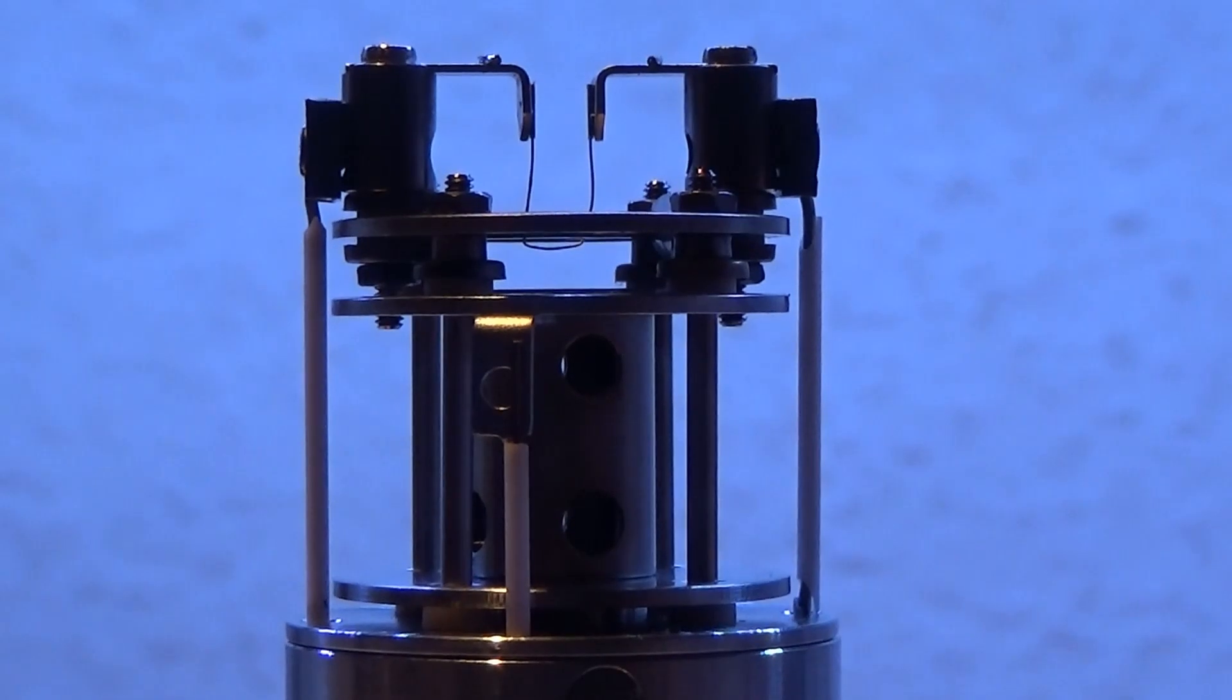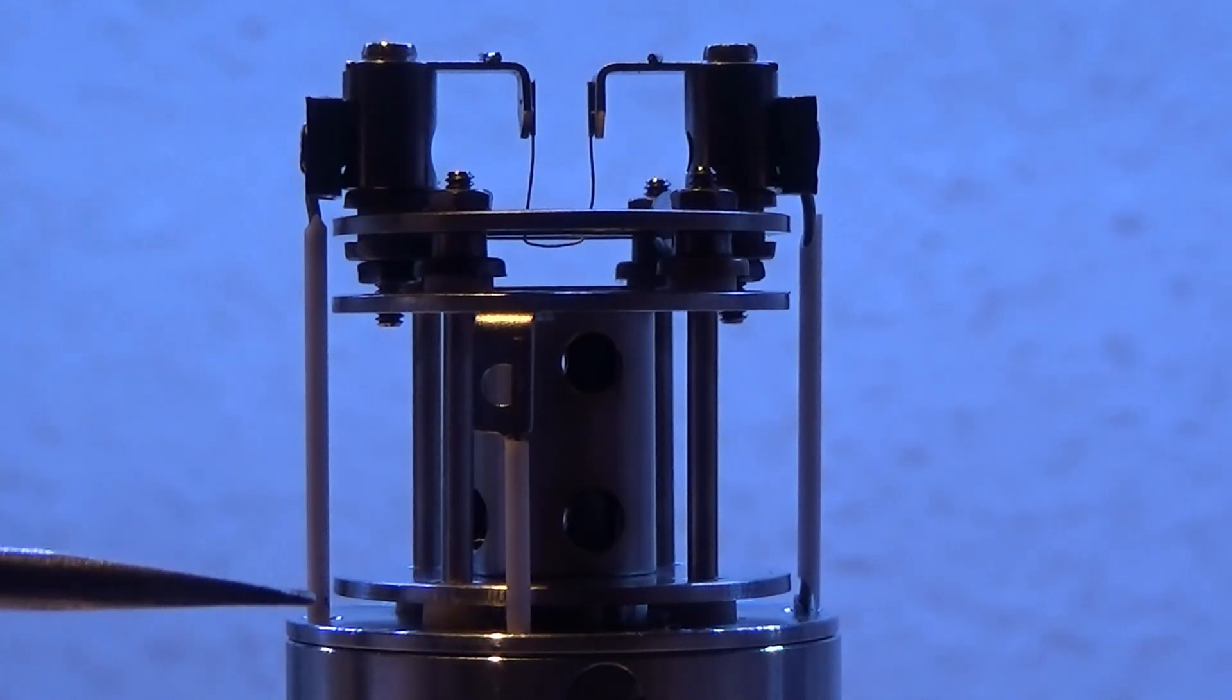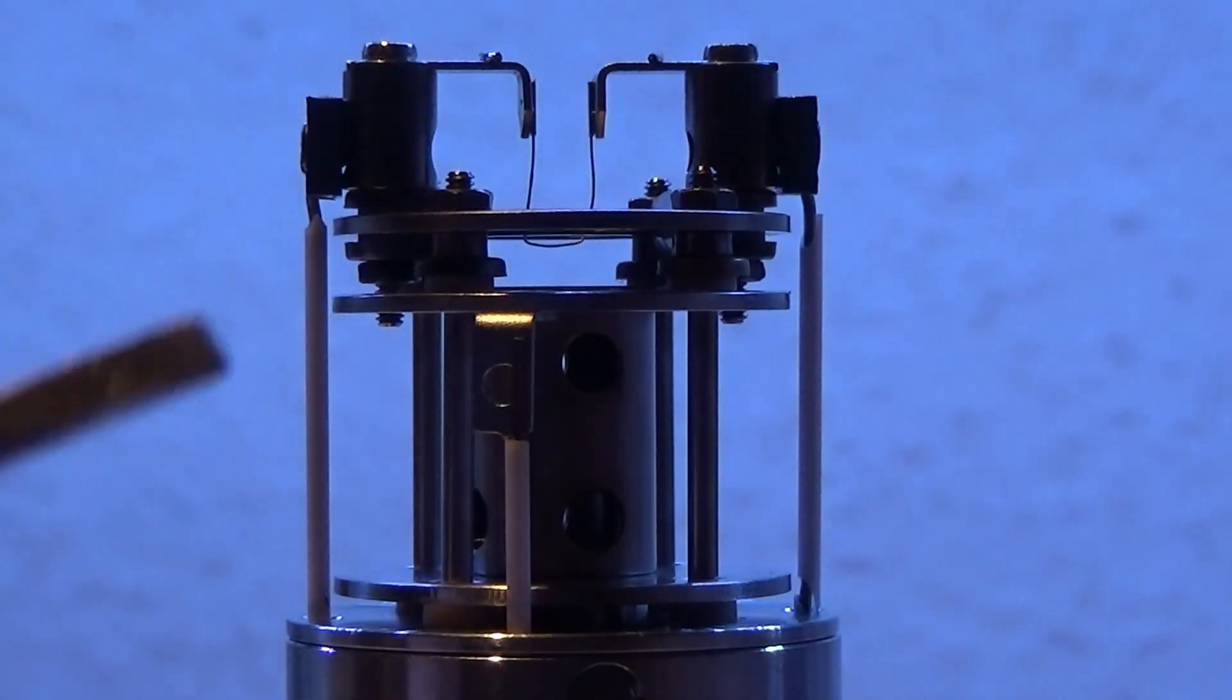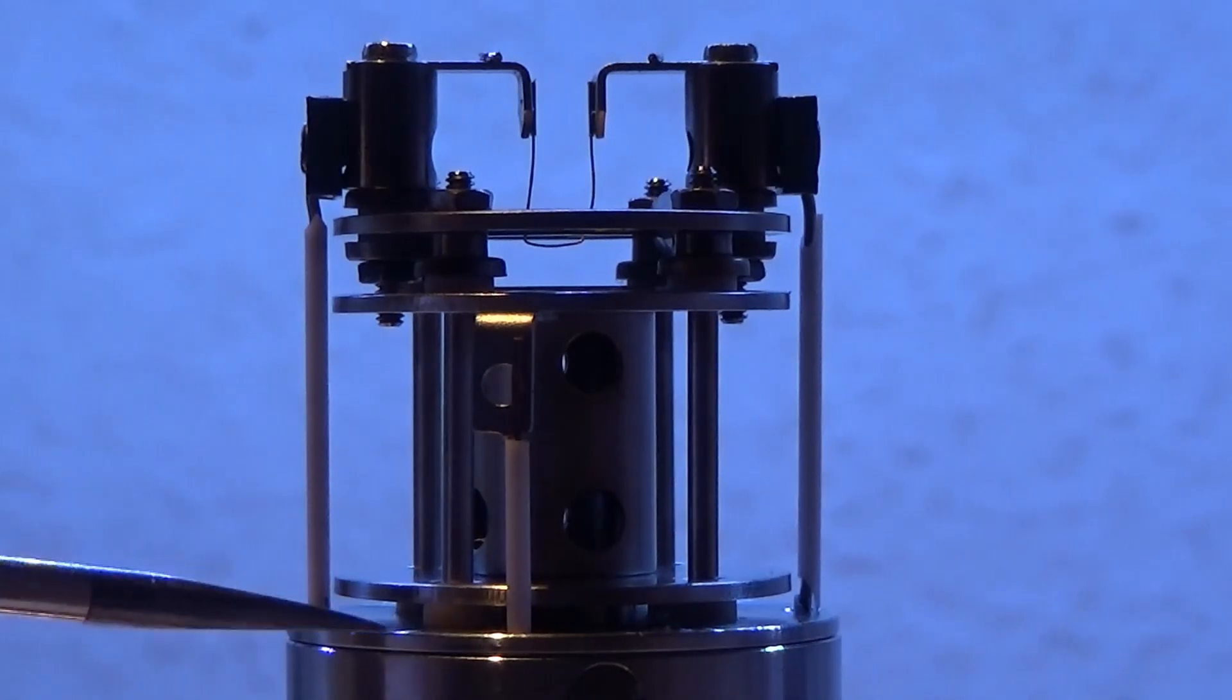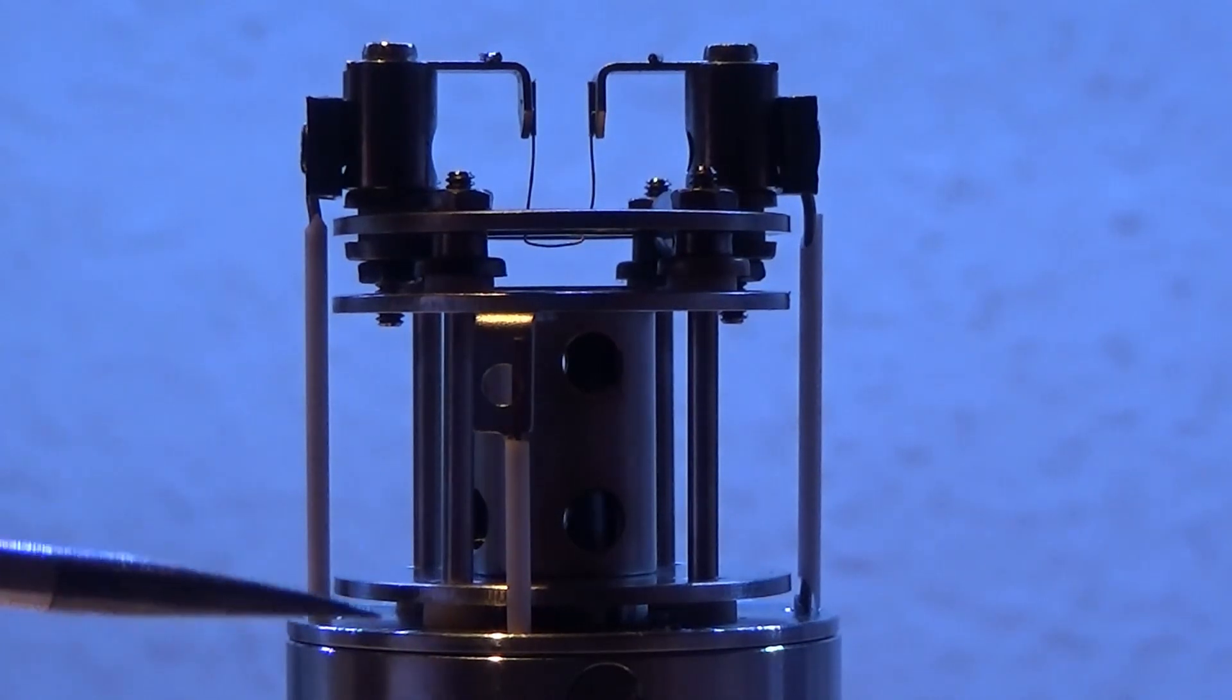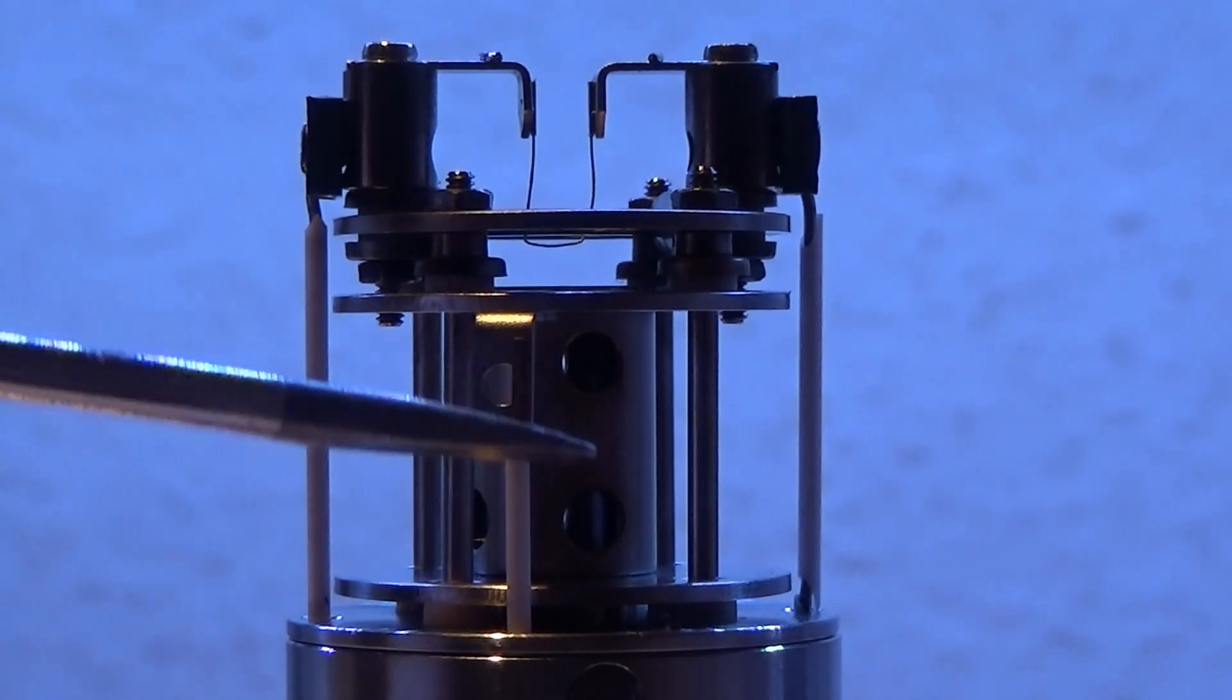So this is the ion source. It's pretty simple. Let's start from the bottom. Here is the metal cylinder that houses the quadrupole. It's grounded. It's at zero volts. Same voltage as the case of the vacuum system. On top of that here is a thin plate that has a hole in it. That small hole is what extracts the ions into the quadrupole. So in mass spectrometry, first we want to make ions, then we want to sort them by mass, and then we want to detect them. So this up here is where we make ions. There's a grounded plate here that's connected to this grounded tube. There's a small hole in the center that extracts the ions out. On top of it is this insulated structure here with a plate, a cylinder and a plate.